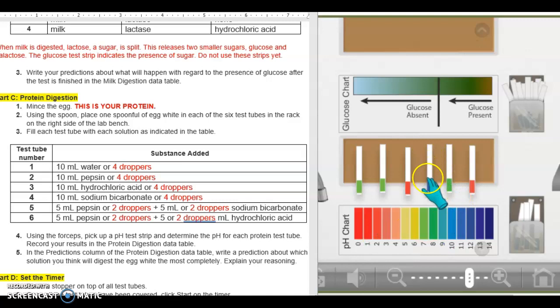The fourth test tube, the blue one, the pH of that is so high, it wouldn't simulate the proper conditions for your stomach. So even though you do have a base in your digestive system, it's on the other end to neutralize it before it comes out the bottom end. The last test tube here is the right pH scale. It's in the 1 to 2 range, and it also has pepsin. It has that protein enzyme that we need for breaking it down.